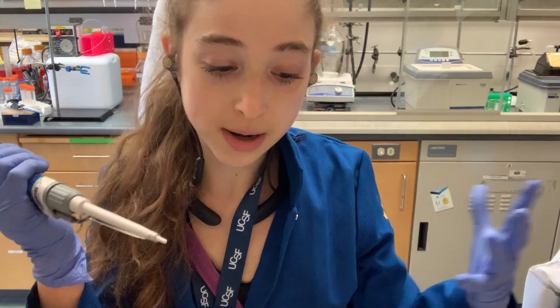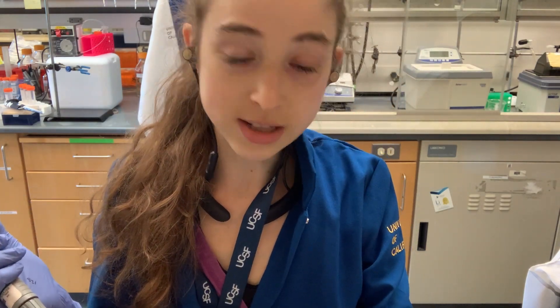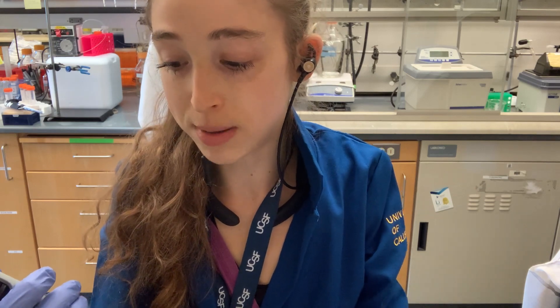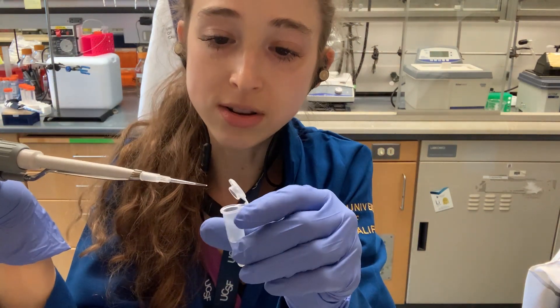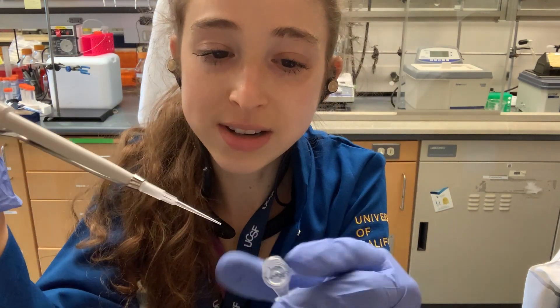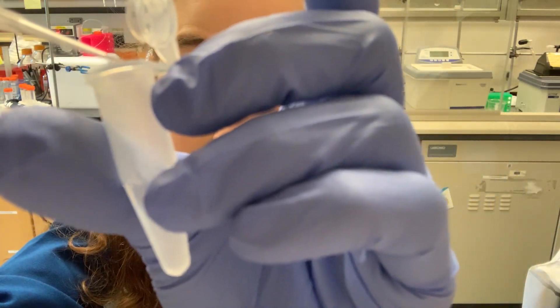Speaking of pipetting really small volumes — when you're pipetting really small volumes, especially a clear liquid, it can be really hard to actually see the liquid inside and to know that you actually pipetted it up, especially when it's coming up to one of these lines. It's really hard to see, especially when you're doing stuff and it's in a tube. So you always want to look and make sure you've actually drawn up the liquid that you thought you drew up. And when you're pipetting it out, watch that little line of liquid go down.